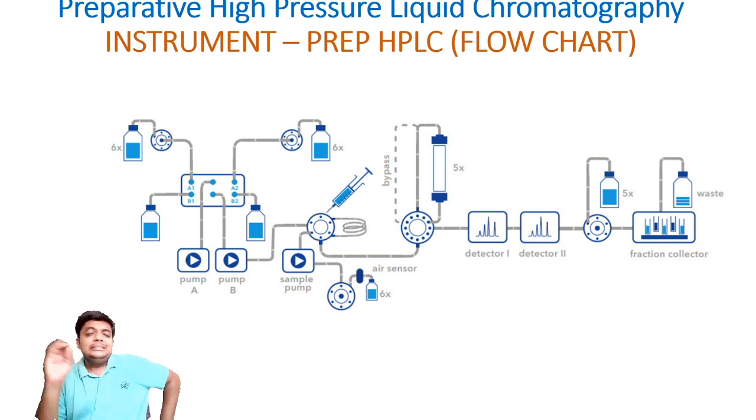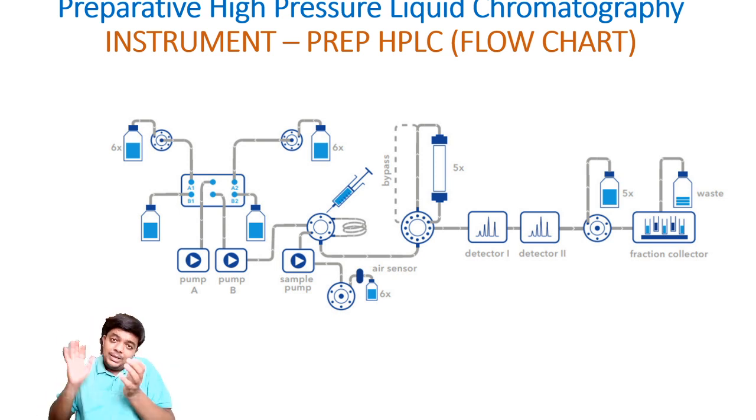You can very easily get prep HPLCs having the capacity in the loop form of a sample injector up to 30 ml. So friends, when giving a proper thrust, proper flow to this 30 ml quantity of a sample, you always require an extra pump.